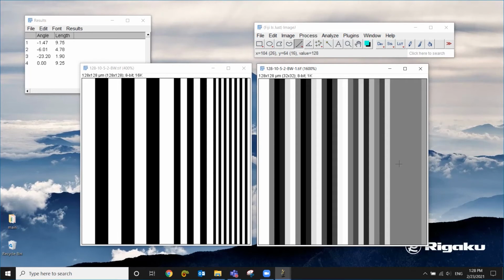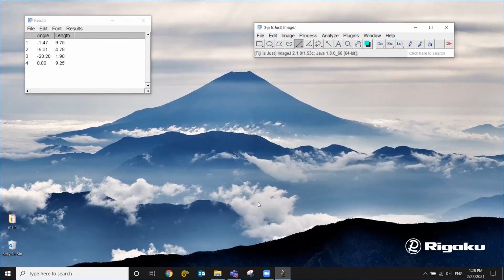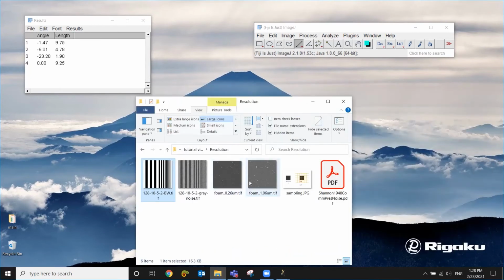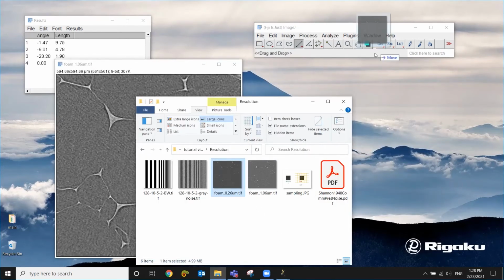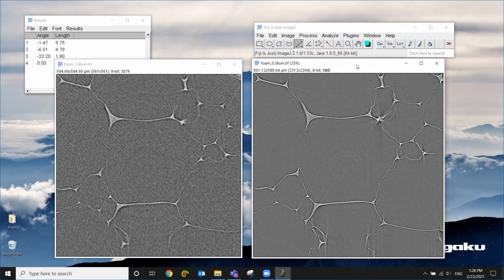So those are kind of theoretical examples, but as the last step, I'm going to show you an actual CT image. And let's compare those two. So those are CT cross-sections from heat insulator, which we really needed last week in Texas.